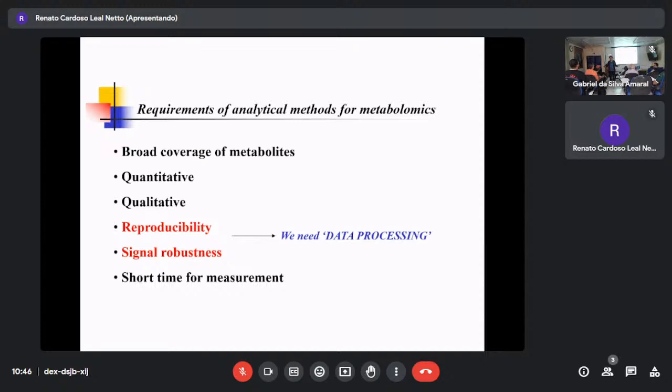This is not an issue for qualification, to identify. Like your case, when we are doing 2D NMR spectra, like COSY, HMBC, HSQC, HMQC, those we cannot use for metabolomic profiling. Why? Because they are not quantitative. Signal intensity must be proportional accurately to the concentration.